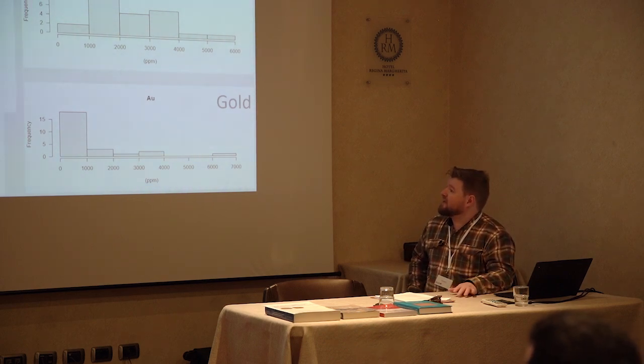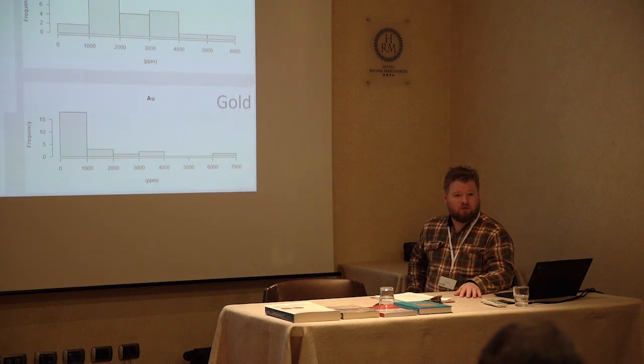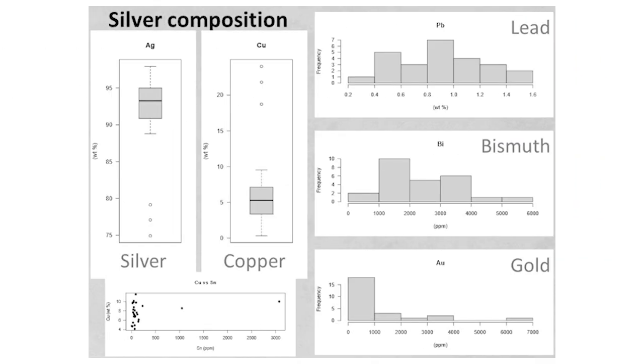So if the lead is native to the silver from the process of cupellation, then we're in a safe zone for seeing where the silver comes from. The lead is a proxy. But if the lead has been added, then we're only looking at the lead.